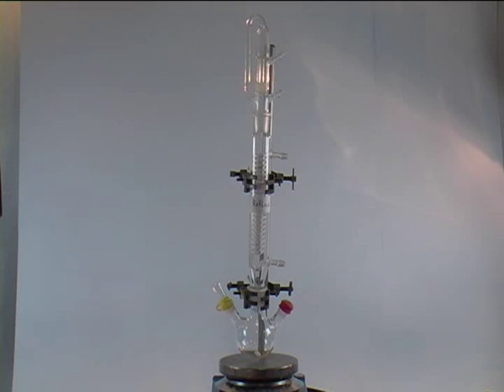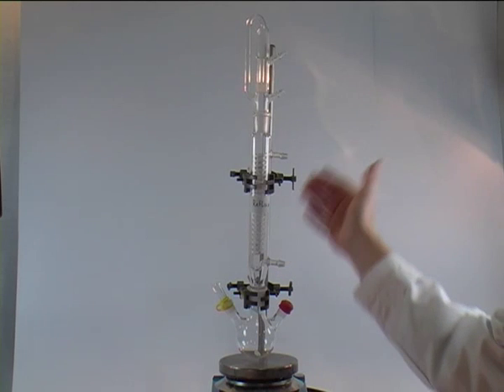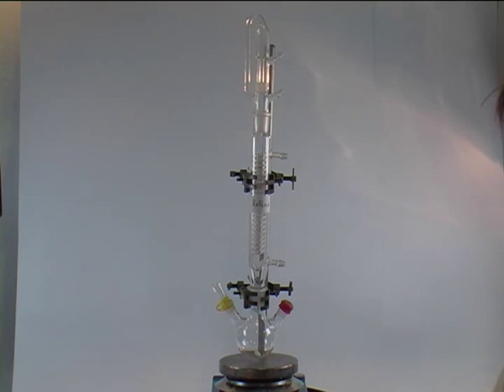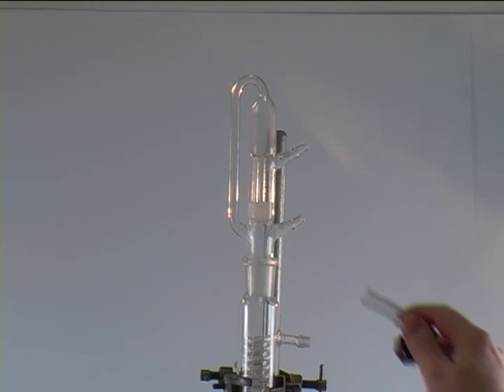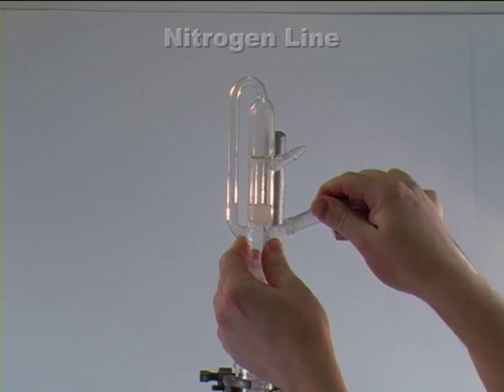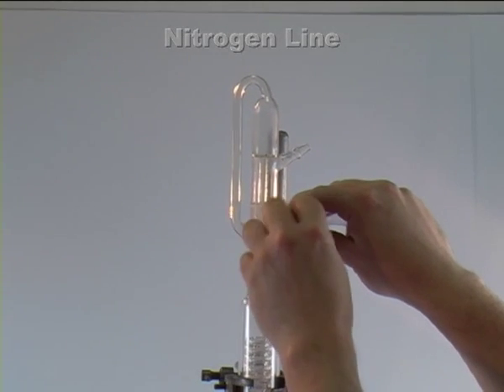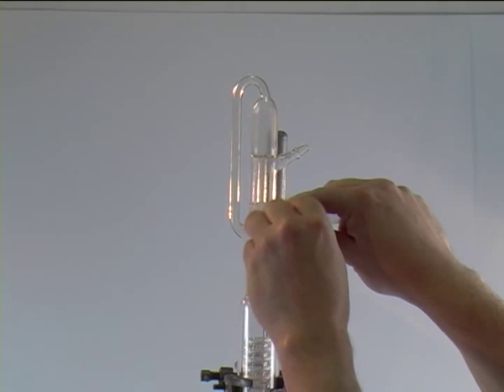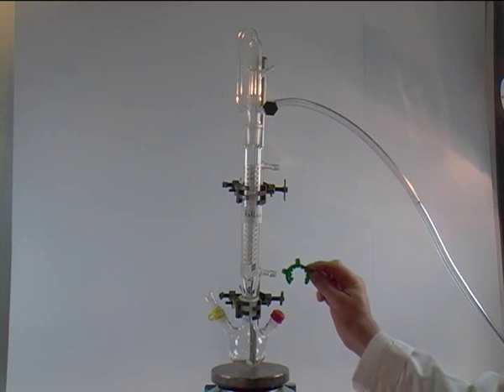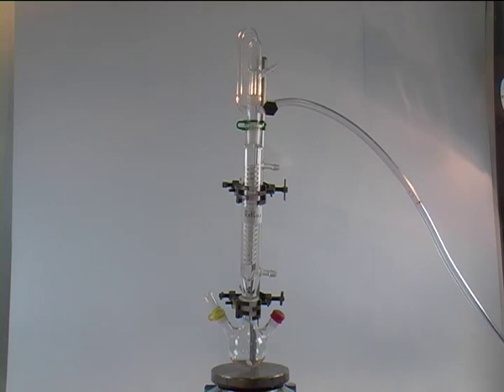And all that remains is to connect the lines, the water for the reflux condenser and the nitrogen for the nitrogen bubbler. Now we connect the nitrogen inlet of the nitrogen bubbler with the nitrogen line and we secure it with a jubilee clip. Once that is done, we clip the nitrogen bubbler with a green clip securely on top of the reflux condenser.